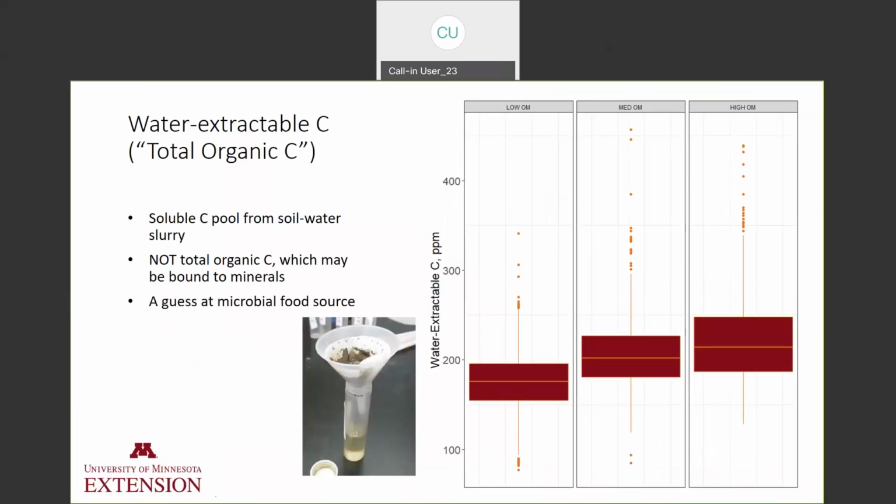So these box plots work by showing you the median as this line in the middle, and then the bottom of the box plot is the 25th percentile, and the top of the box plot is the 75th percentile. So 95% of the data is encompassed here in these lines, and any dots like this are statistically determined to be outliers. So you consider the really average range to be within the box and the quote normal, but encompassing the extremes to be everything touched by a line.